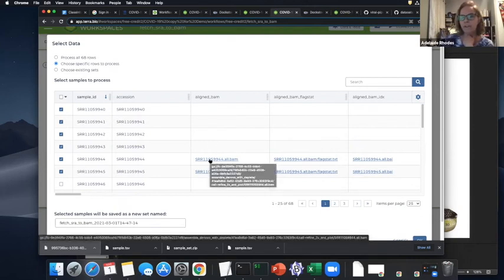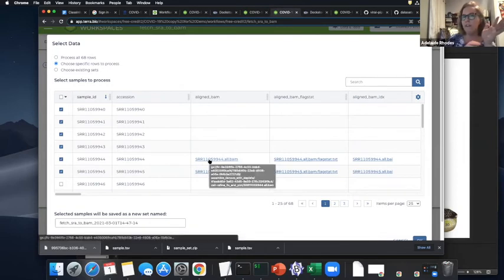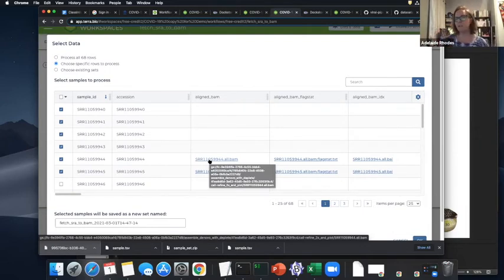If you hover over it, you can see they're in a cloud bucket that doesn't belong to me. So this workspace, when they ran it, they made all the data publicly available. So I don't actually have to rerun David Park's workflows. All the data that they ran on those 68 samples is already in their data table and pointed to a public space. So if I wanted to go into what David Park already did and just pull the BAMs out to compare to the BAMs that I would download from the NCBI, this might be a place I would go.